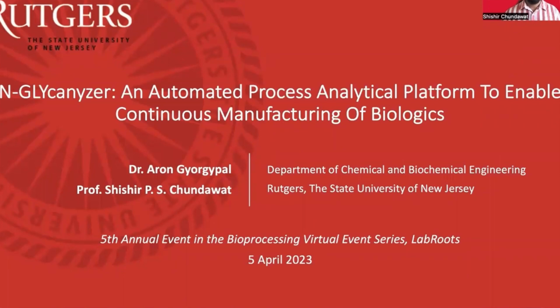Good afternoon, everyone. My name is Shishir Chundawat, and along with me, I have my former PhD student, Áron Györgypál, who will be talking to you about some of the work that Áron has been involved in my lab and how it relates to bioprocessing. So I'll just give a very brief introduction, and then I'll have Áron take over. So today we'll be talking about the N-GLYcanyzer. This is an automated process analytical system and a platform that's been developed in my lab here at Rutgers to enable continuous manufacturing of glycosylated monoclonal antibodies and biologics in general.